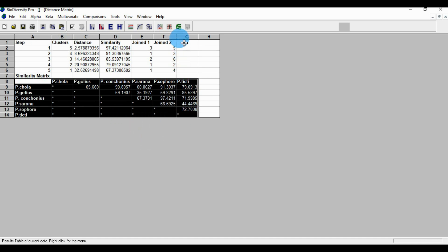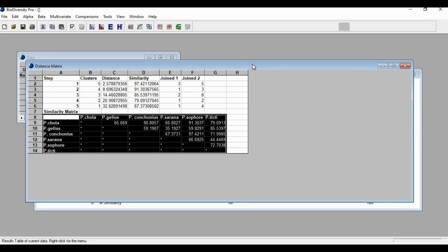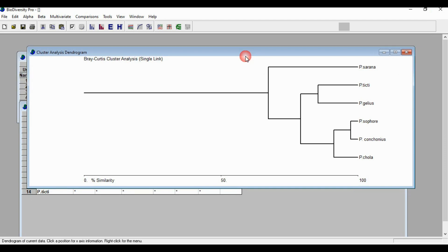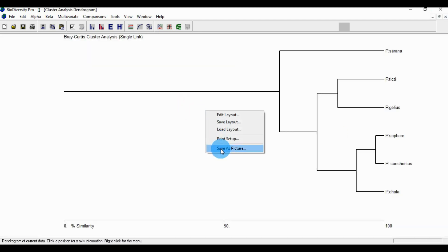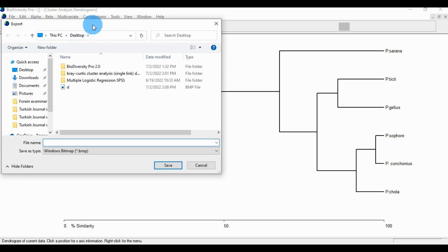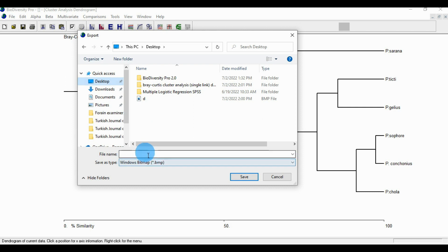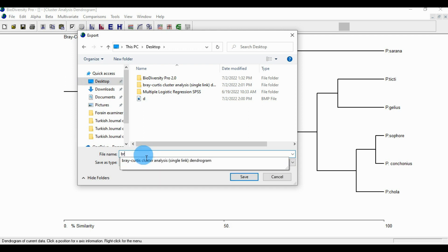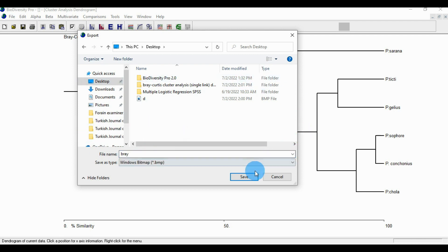Go to the diagram, minimize the window, and click the diagram. Right-click the diagram and select save as picture. A new window opens. Go to the desktop, enter the name for the Bray cluster analysis diagram — name it 'bray' — and save.